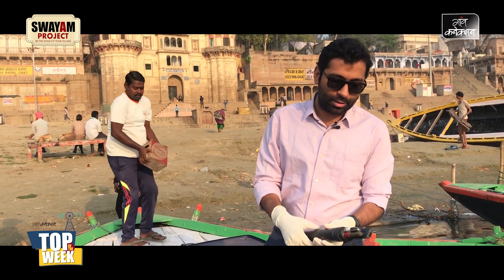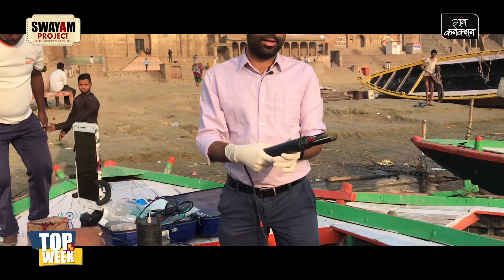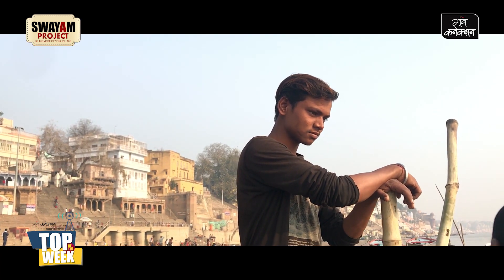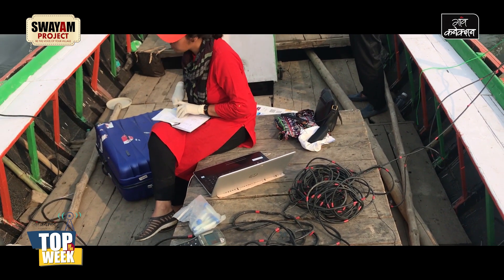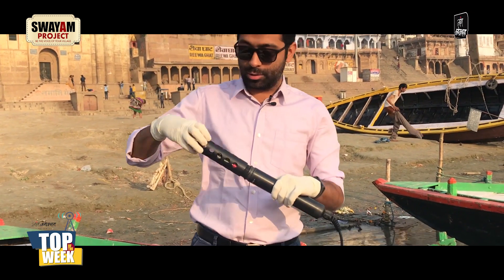If you look at these probes, these are the three probes here, and then there's a rod. It can also measure temperature and pressure in the water. The pH probe can also be replaced with an ammonium or a nitrate probe, which is what we do in the other HANA sensor that we also attach on the board — so we have two HANA sensors that go on a rod.